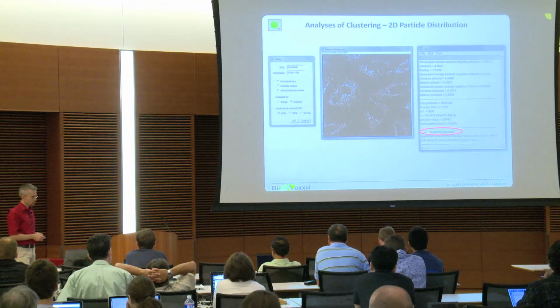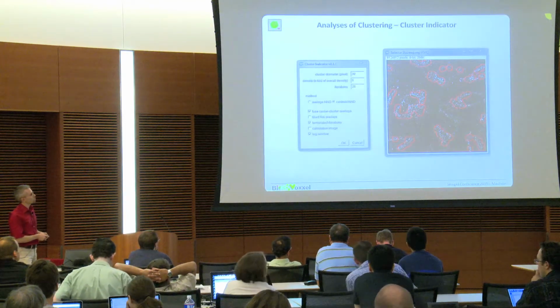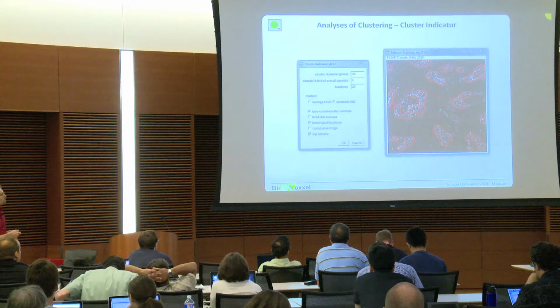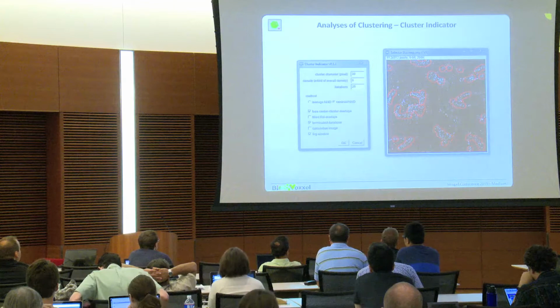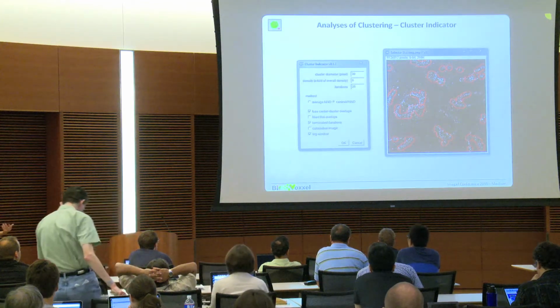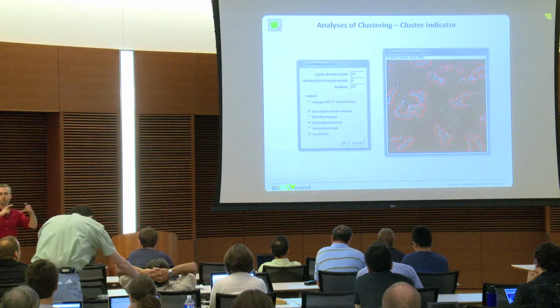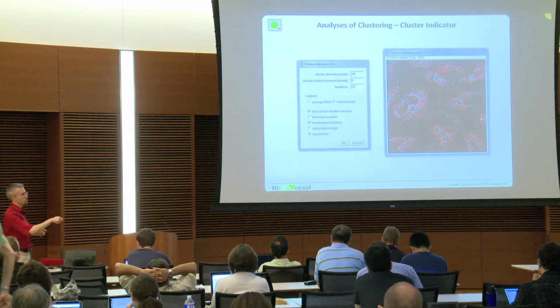after lunch or in the lunch break for those ones, because connected to that, there is also a possibility to then indicate where these clusters are occurring. That is not unbiased, it is user biased, because you need to key in a size of a tool which should check for the clusters. These are these small circles.